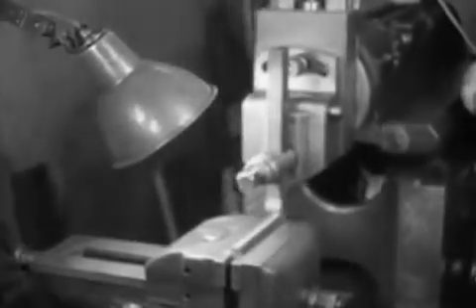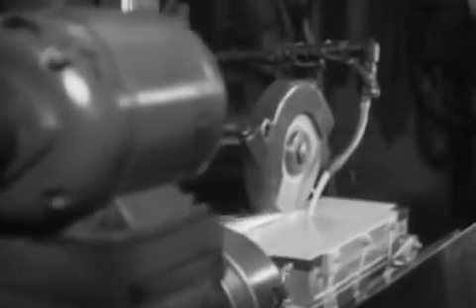The section is then broken open under a steam hammer at the flaw. It is then returned to the laboratory, where the flaw itself, in this case a minute fracture, is carefully examined. The section is then sent to the engineering workshop, which is part of the laboratory, where it is cut into specimens for laboratory testing. These specimens are made with great accuracy and finished to exact sizes by skilled craftsmen.